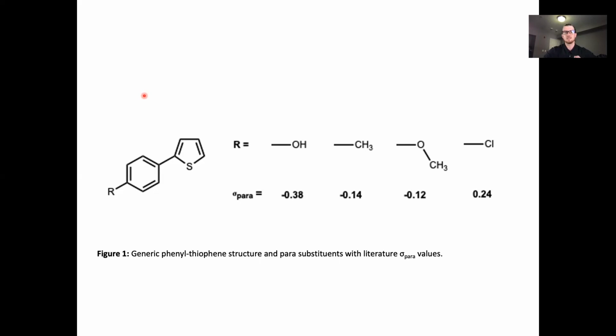However, I will not be discussing the Hammett analysis here, as our research showed that we were not able to test enough molecules of interest in order to discuss it. So I will mainly be discussing cyclic voltammetry and the oxidative behaviors of the reactions that we performed.